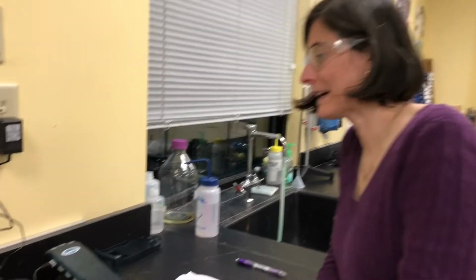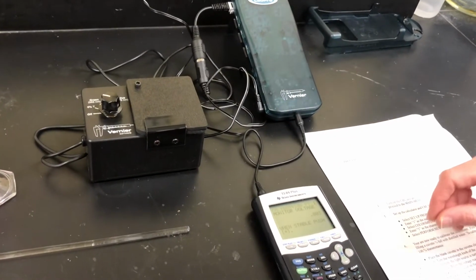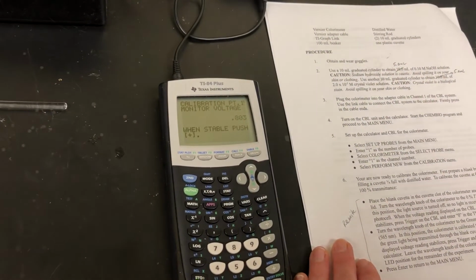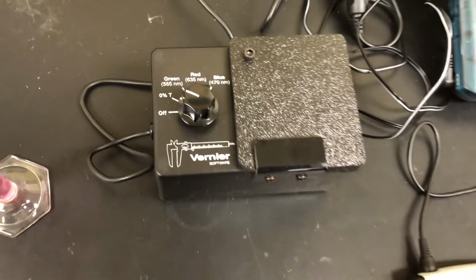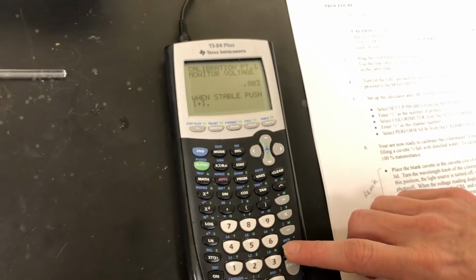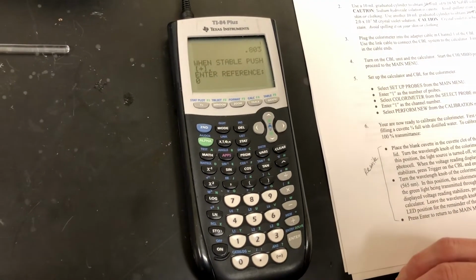Now that we've selected the correct channel to allow the calculator to get data from the colorimeter, now we have to calibrate it. So I have a cuvette in here filled 3/4 of the way with deionized water. For our first point, what we want is essentially 0% transmittance, so we turn it to the 0% setting there. And then it will equate it to a certain voltage. Once this voltage is fairly stable, which it looks like it is, it tells us to push the plus sign. So I'm going to go ahead and push the plus sign. Now they want to know what reference it is. Well, this is our 0% transmittance, so we type in 0 and we hit enter.